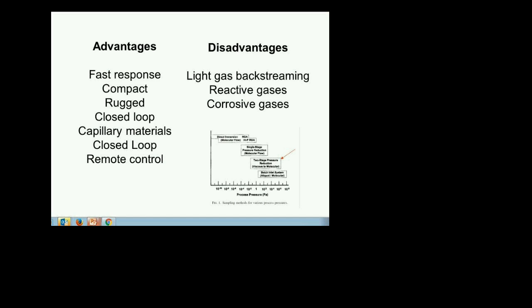The magnet just comes off with one screw. You can just pull the magnet right off, so you don't even have to use a blank flange. If you don't see any change in the spectrum, then you're done. There is no residual effect. Either the magnet is affecting the trajectory of the electrons or it is not. This is not something that builds up over time, and you're not going to magnetize the RGA. It either is affecting it or it is not.